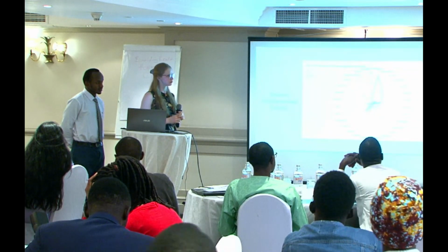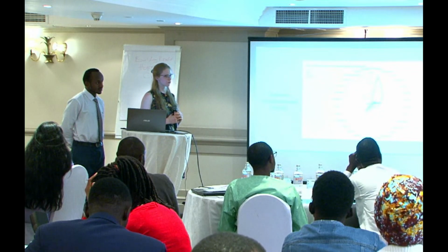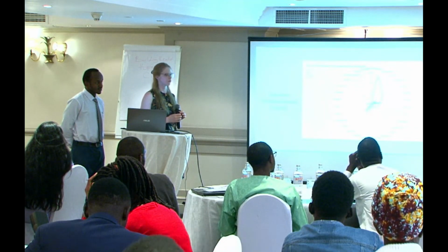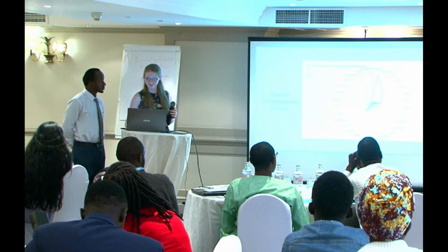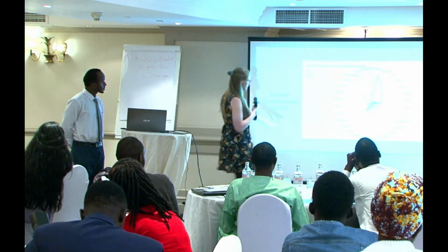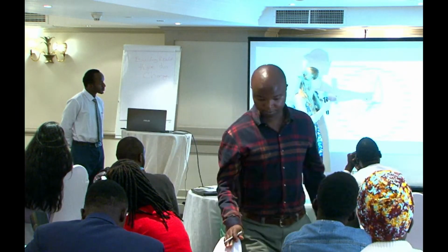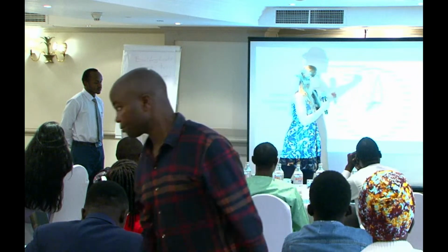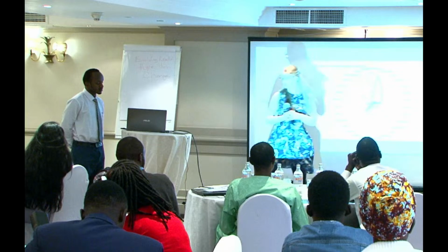Maybe just a comment: if I tell you my height is 1 times 10 to the negative 2, does that make any sense? The same goes for your areas. Please put a scale, okay? The peak areas. Yeah, there is a scale. See? This is a percent area. This ring is 25%, this ring is 50, and this ring is 75. We didn't have anything higher than that. Now go back to the other table.